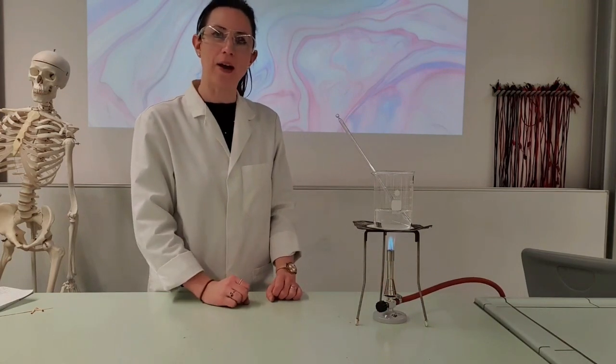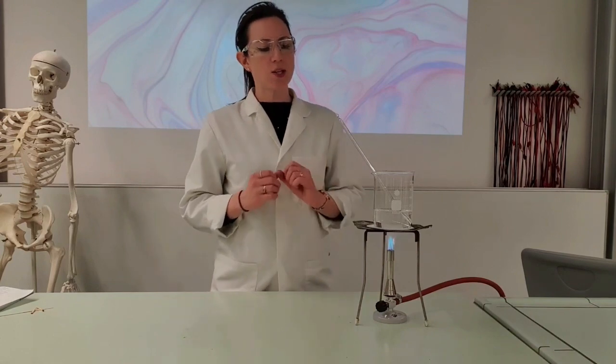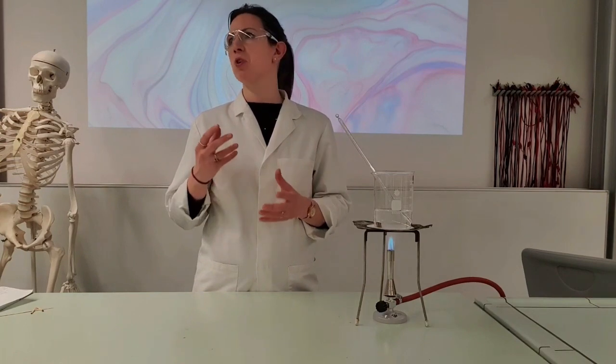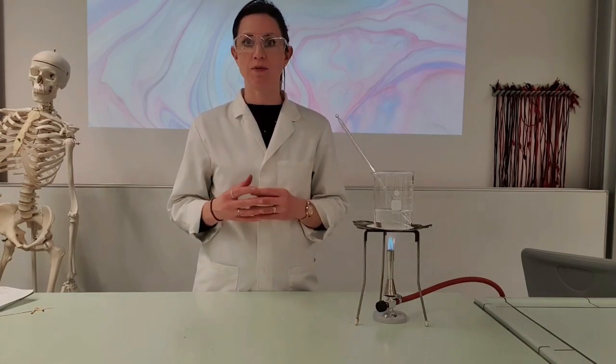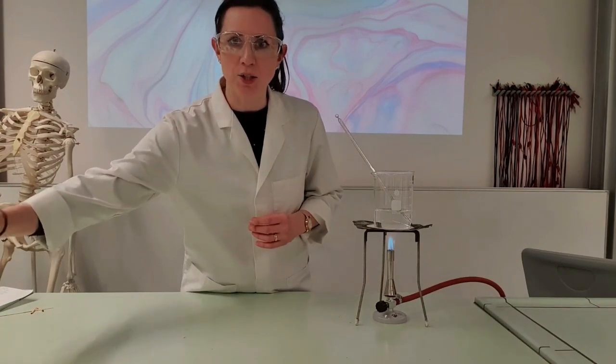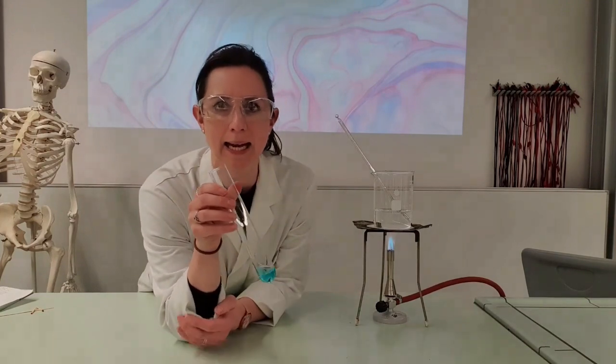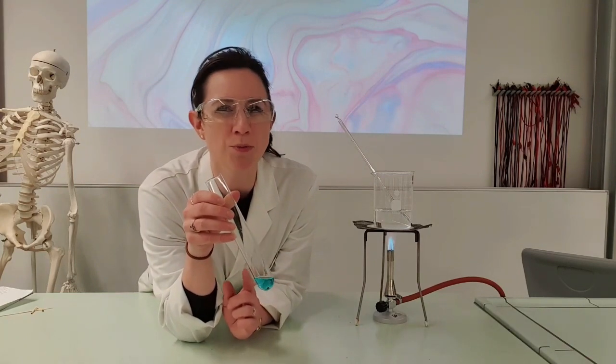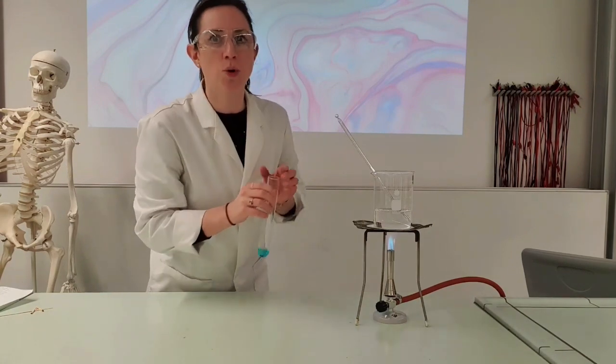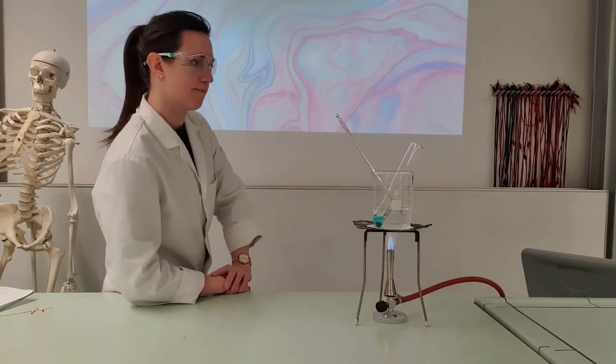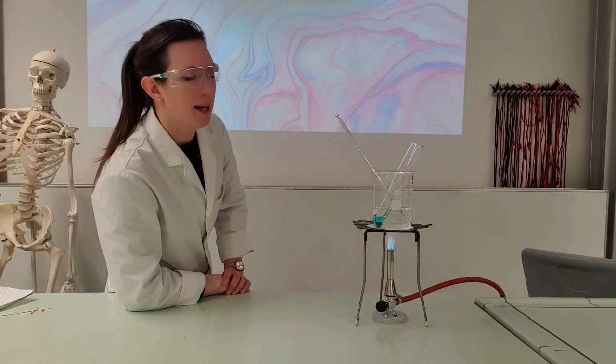Now I've set up my water bath ready to go. So you would use this kind of water bath for something like a food test. Let's say I've got glucose, for example, and I want to have a positive test on my glucose sample. I would then add some Benedict's solution. Now Benedict's is an indicator that changes from blue to another color, which is actually red if the glucose is positive. But it won't do it unless it's very hot, and that's why this water bath comes in handy.